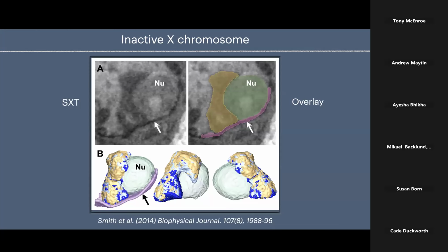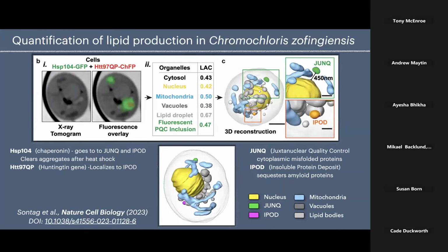And not all of the nucleoli and structures look the same. That's a little bit different structure. This is yeast, and this shows you the difference in the contrast in yeast.